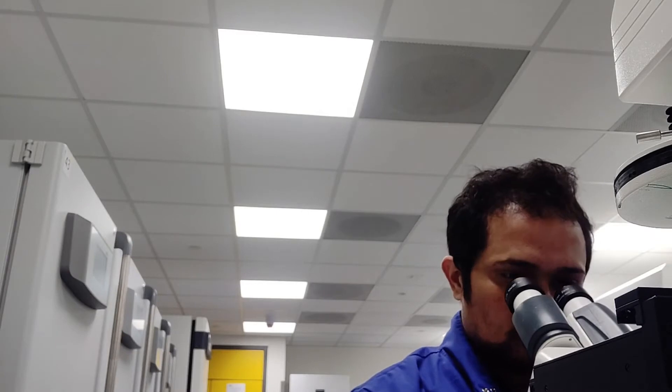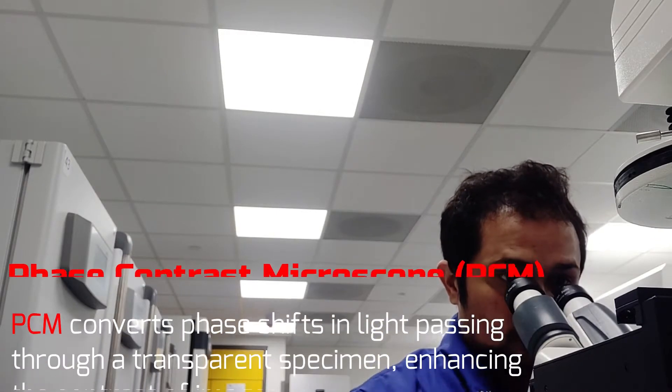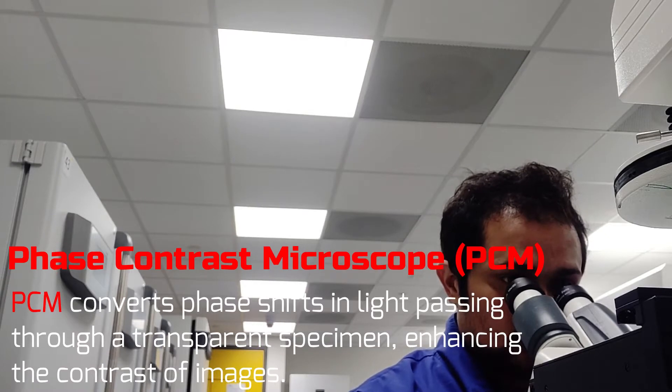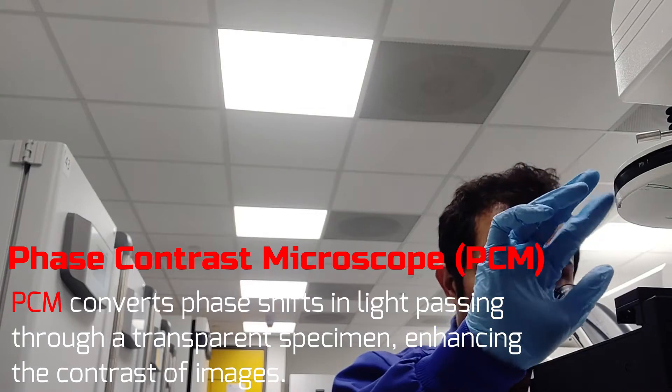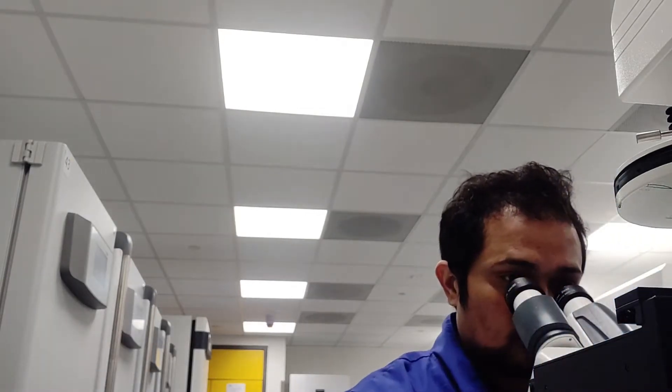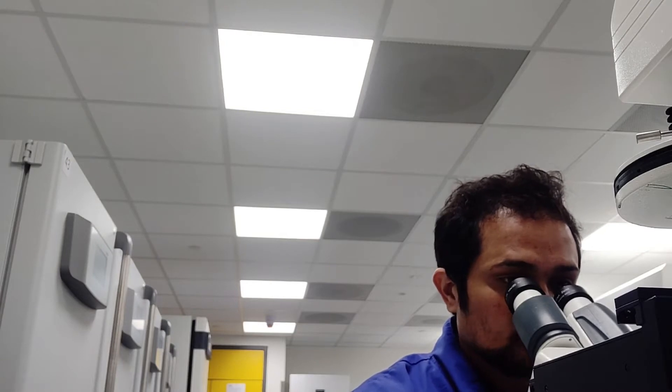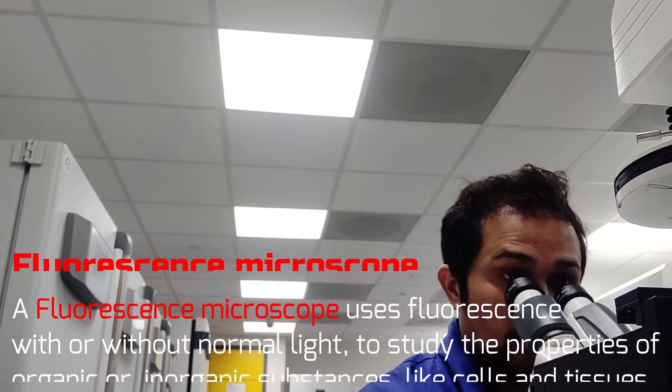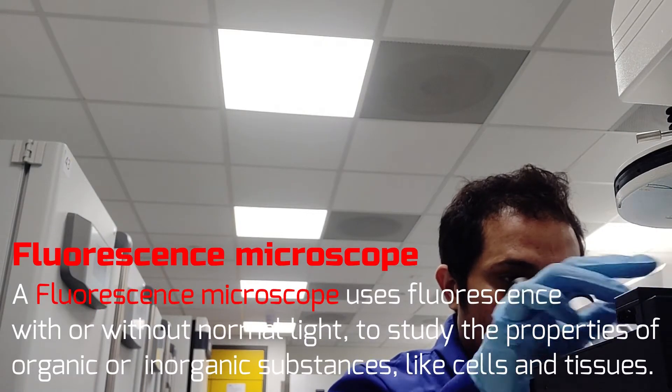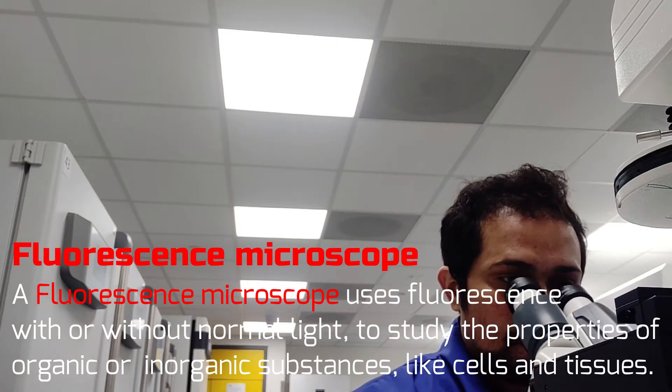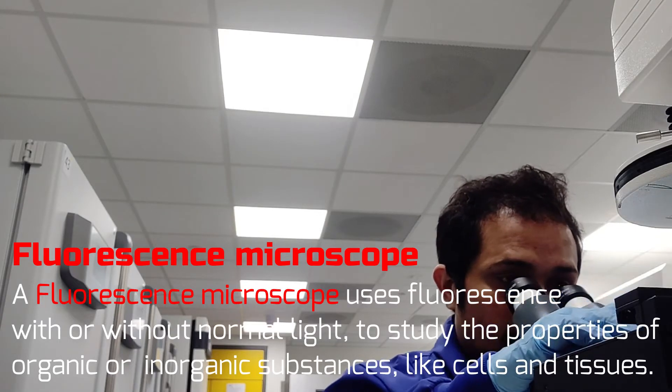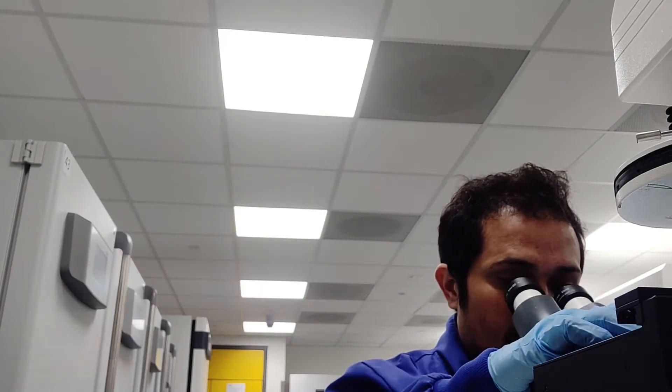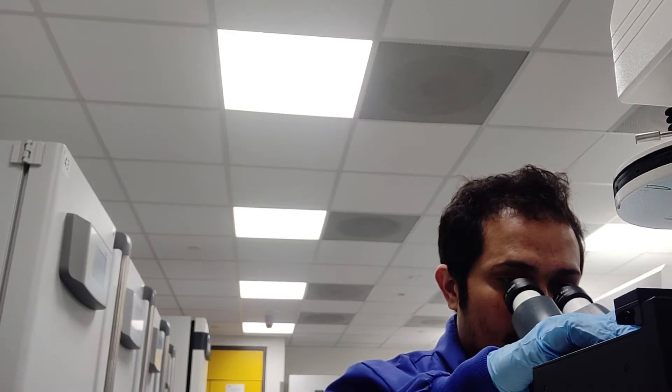The microscope I use to look at my cell is a phase contrast microscope. And it is quite good to look at the cell because you can manipulate the phase and look at different magnification. Of course, you have to know the instrumentation of the microscopy and how the light works and how different phases affect your object in which you are looking. Apart from looking through the phase contrast microscopy, this microscope that I use also has fluorescence capability. That means that I can bind my cells with any fluorescence antibody and then I can watch those fluorescence signals on the computer monitor or even through the eyepiece.